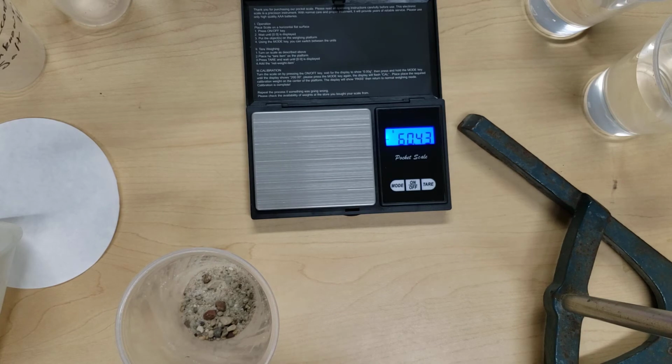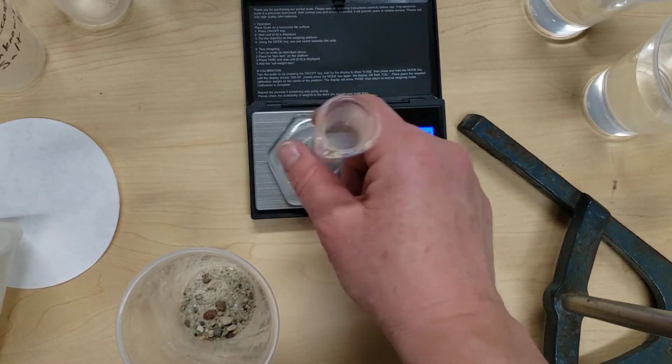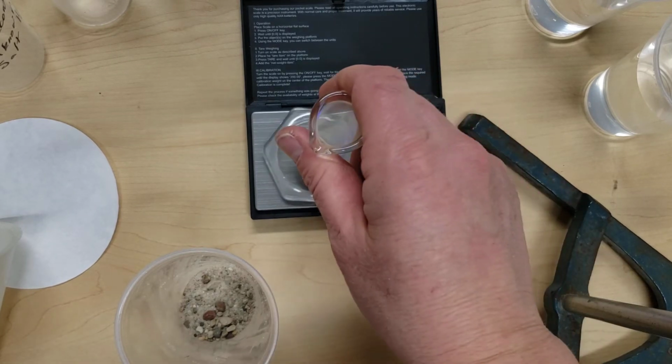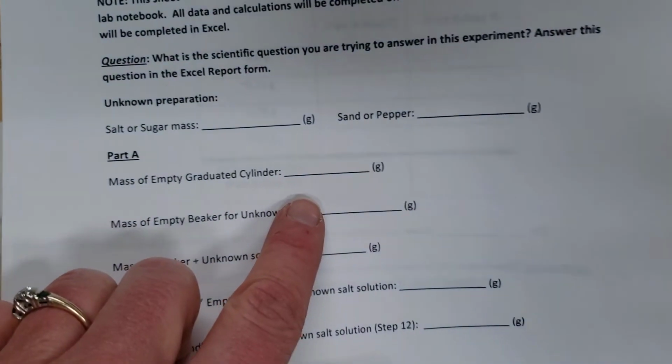For part A, we're now going to weigh the mass of an empty, clean, graduated cylinder. So let me tare the balance. We'll get the mass, and we want to record that mass on the report form so that you can use it in Excel.